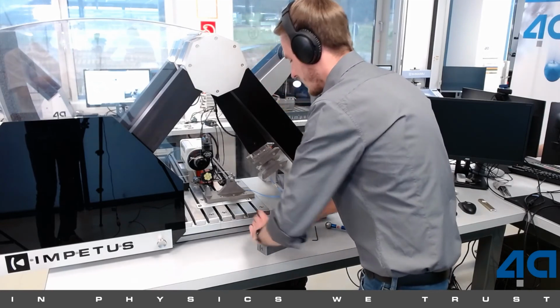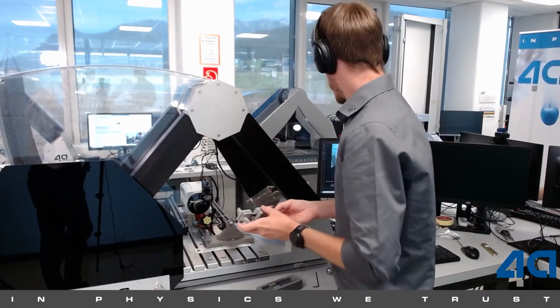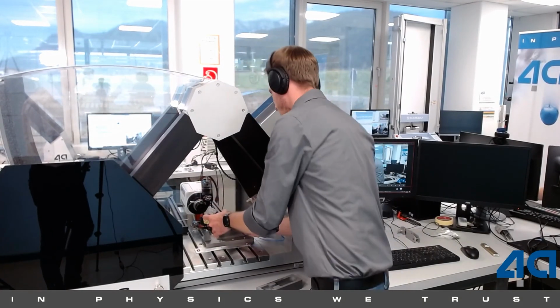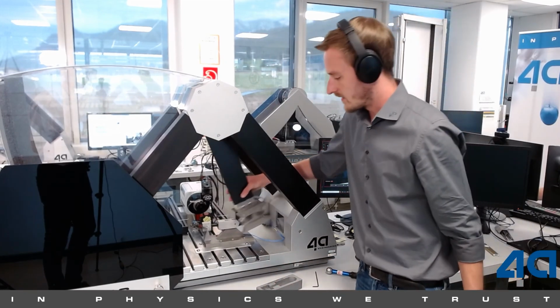So now we are ready to test this sample, as you can see here. To test, we just have to hang in the sample in the counter-bearing system like that, and have the same procedure as we do at every test.